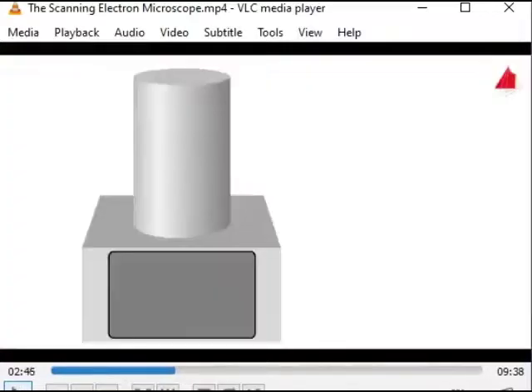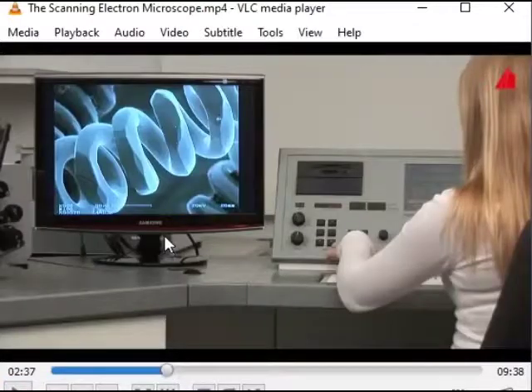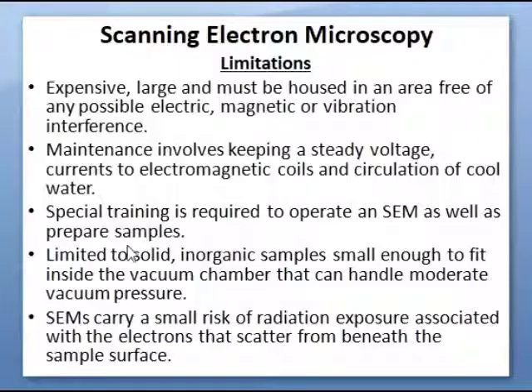So you have seen how an image is generated by using a scanning electron microscope. In comparison with an optical microscope, this can generate high precision images without diffraction of the light. So right now you are seeing an image of a tungsten filament zoomed or enhanced at around 1000x. That means it has been enhanced 1000 times the original component. So by this we will end scanning electron microscopy.